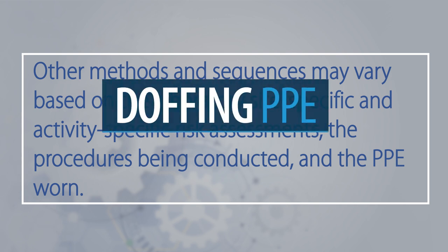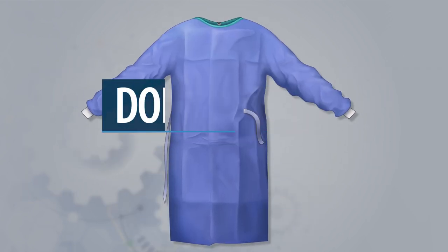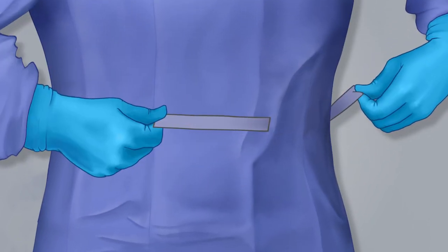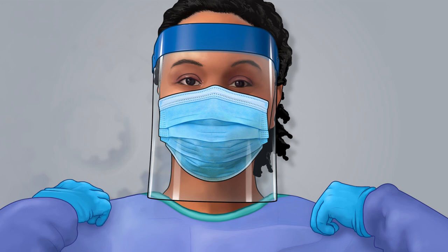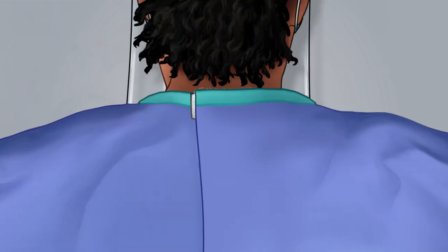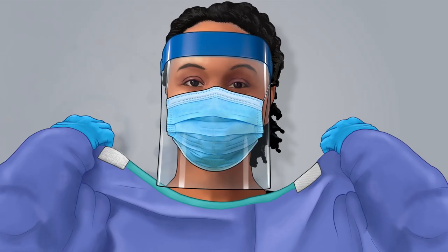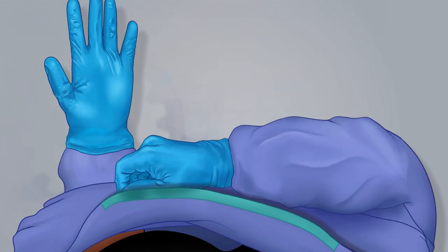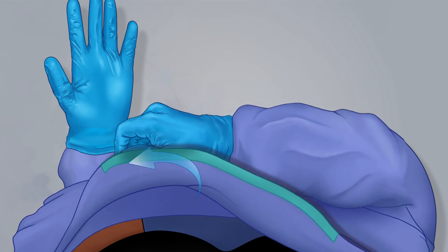The first step of doffing your PPE is removing your gown. To do this, untie the gown at your waist, grasp the gown's shoulders, and pull the gown forward, releasing the neck closure. Pull the gown off of your shoulders and away from your body, rolling the gown inside out as you go.